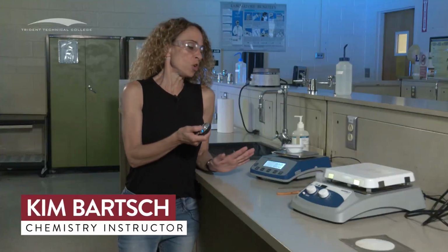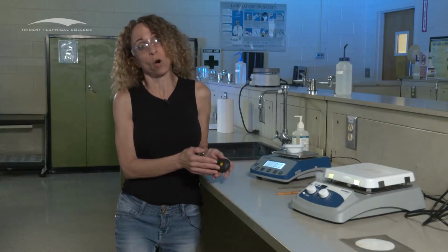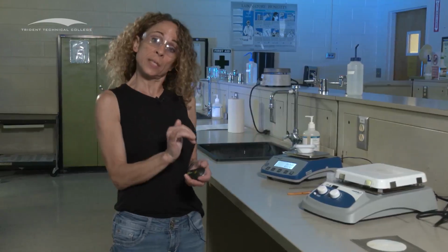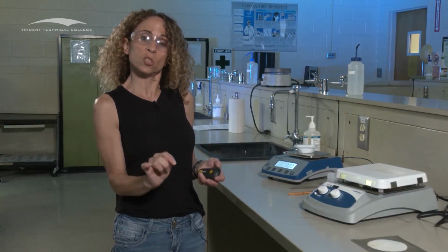Okay, so I'm going to show you how to weigh a solid out, and then also how to do what we call heating to a constant weight. Both of these techniques are going to be used when you do the alum and the decomposition of baking soda labs.